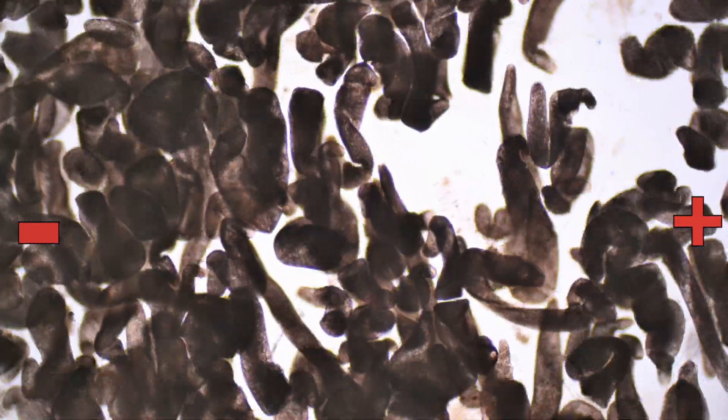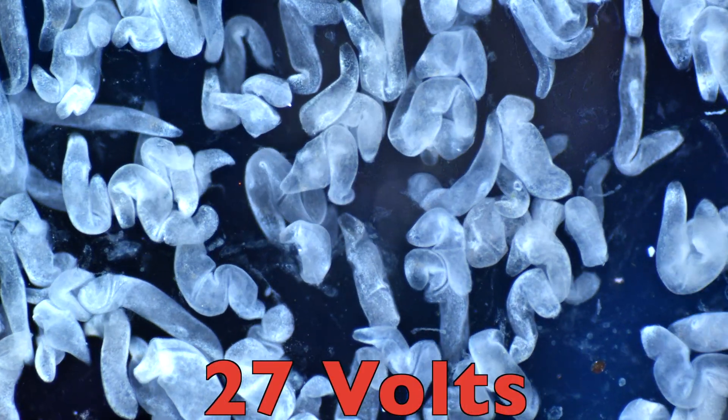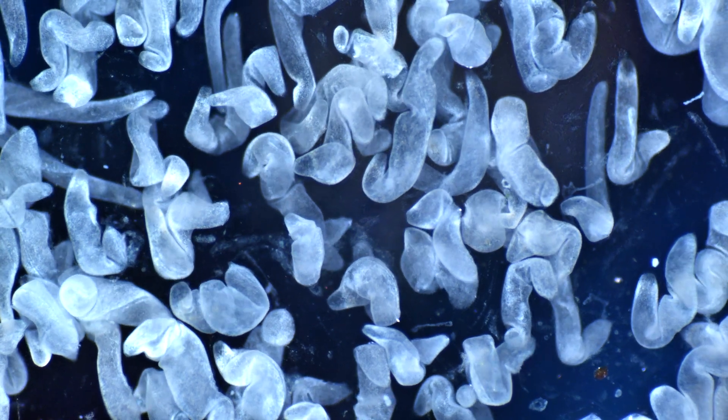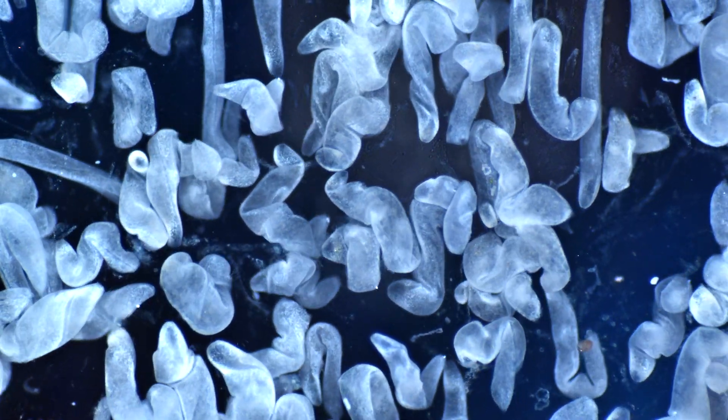The strong reaction of spirostomum is really surprising. I don't know if spirostomum is getting damaged by the current. I'm currently trying to understand what happens to them long term after they have been exposed to electricity.